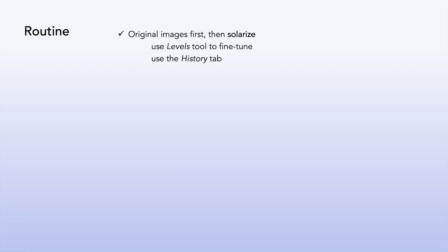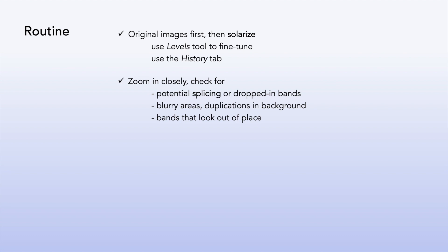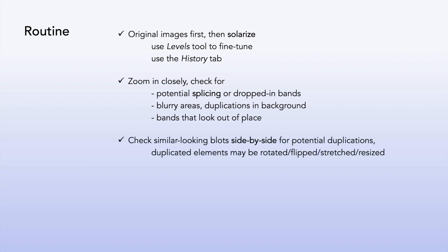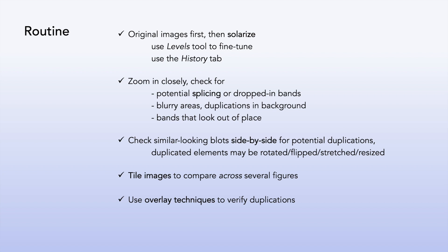Summing up — when screening blots, try the following routine. Look at the original figures first, then solarize the images in Photoshop; you can use the Levels tool to fine-tune and the History tab to return to the original view if necessary. Zoom in closely and check each panel for hard edges and potential traces of splicing or dropped-in bands. Blurry patches might point to inappropriate data alteration. Duplicated areas in the background suggest cloning and should always be flagged. Also check whether any of the bands look like they don't belong. Compare similar-looking blots to look for potential duplicates, and remember that these may be rotated, flipped, stretched or resized. Tile the images and look for whole panels or individual bands that might repeat across the figures. Duplications can be verified by using overlay techniques. To help understand and clarify potential issues, raw data should be requested from the authors.